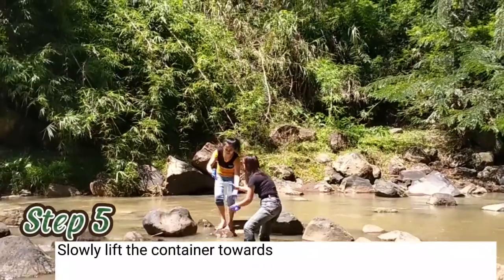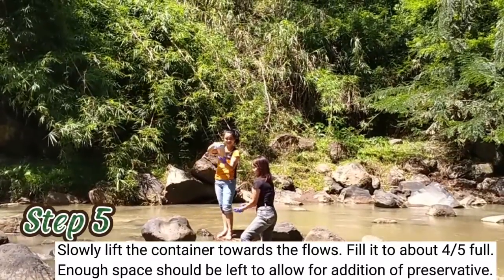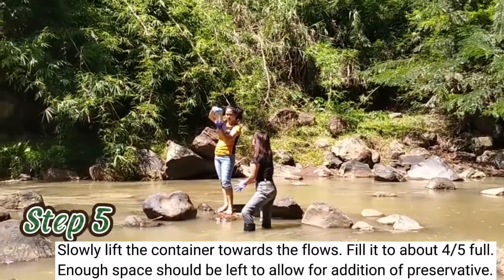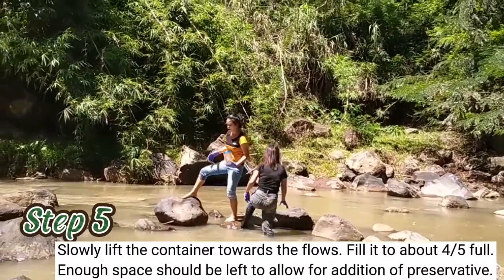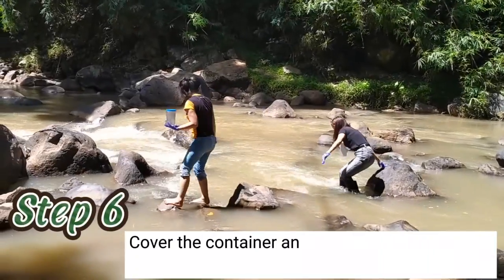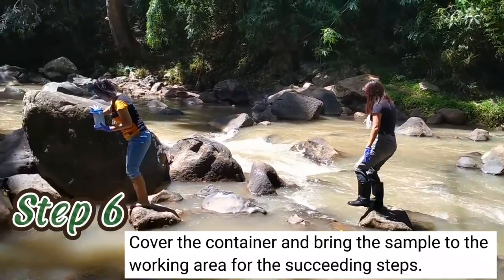Step 5: Slowly lift the container towards the flow. Fill it to about 4/5 full — enough space should be left to allow for additives or preservatives. Step 6: Cover the container and bring the sample to the working area for the succeeding steps.